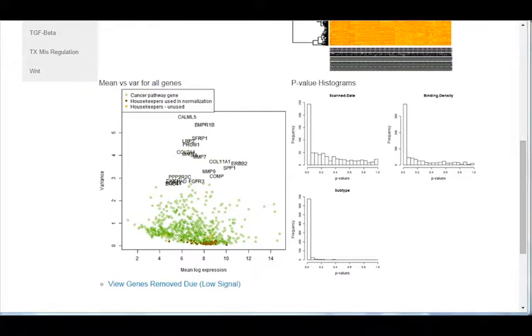It is good practice to understand the effect of every available covariate on gene expression. The plot on the right draws histograms of p-values for the associations between all genes and each covariate. Covariates with no association with gene expression will have flat histograms, and covariates with widespread effects on gene expression will have peaks near zero. Technical covariates with such left-weighted histograms should be adjusted for in downstream analyses so as to avoid confounding.